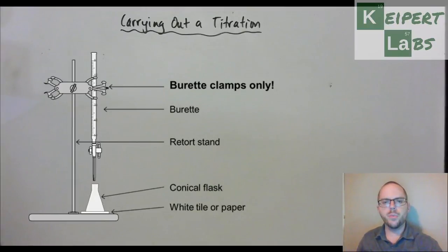What we do is use a retort stand and a burette clamp. We can use a normal moss heading clamp if we're in a pinch, but they're not usually the best idea. We have on the bottom of the retort stand our conical flask, typically with a bit of white paper or white tile underneath it for colour contrast. Remember in the previous video, we talked about colour change being the key factor here, that we want nice contrast to be able to see the colour change in our conical flask. On top of that rests our conical flask, and above that attaches our burette.